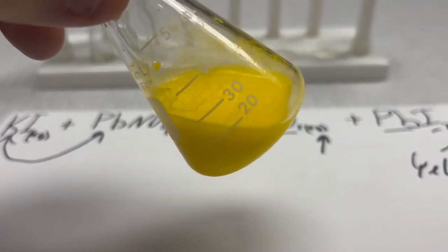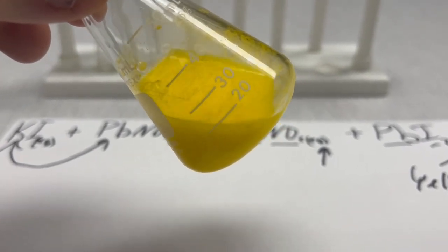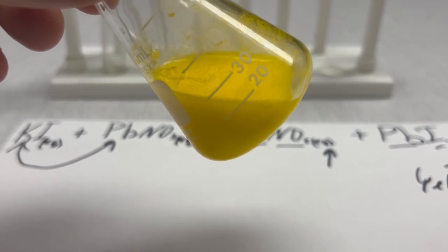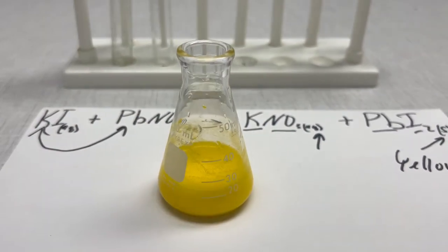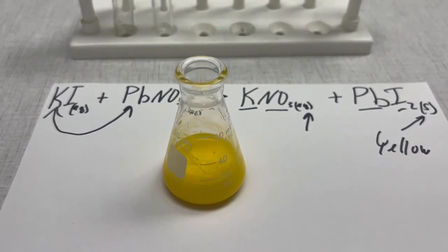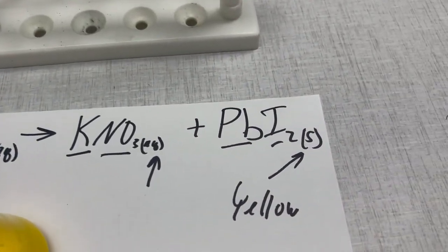But if you look at the bottom, you can see there's two layers developing here. That top layer looks more clear and then the yellow layer is settling towards the bottom here. So we can see that solid that is forming inside of here. So we call this a double displacement reaction where we precipitate, or we create that solid.